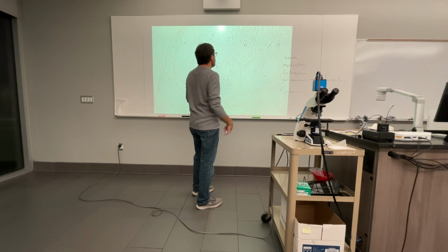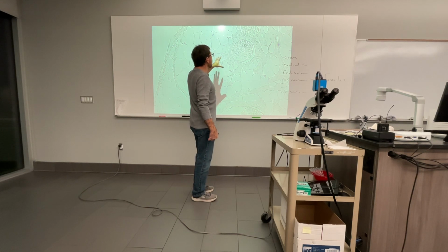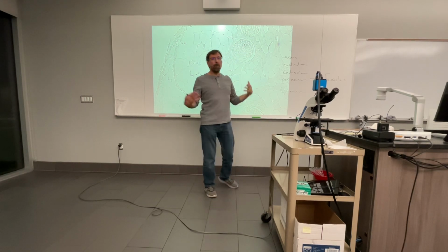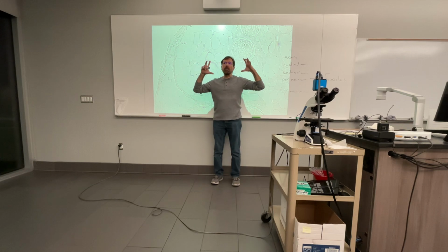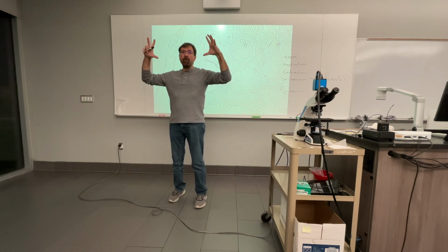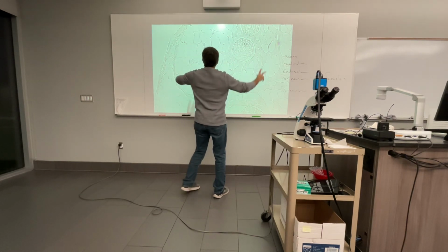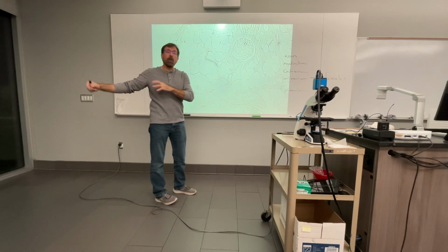Okay, so here's the deal. When you're looking at this, and this one's actually a good example. So we have these two fascicles like butted up next to each other. If we would have been more proximal from this point, so closer to where it branched off the spinal cord, those two most likely would have been one fascicle at one time. They're splitting to branch into separate pathways, okay? When I'm looking at this, that's what's happening. It's transitioning into smaller and smaller pathways.